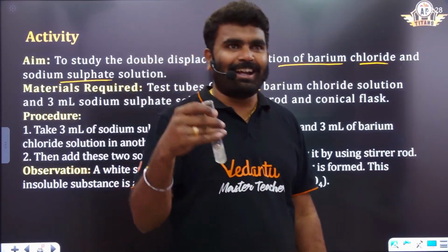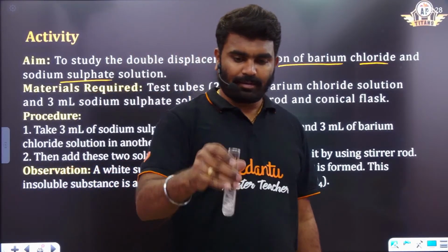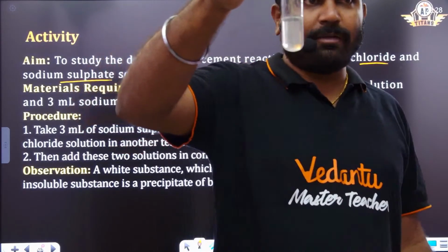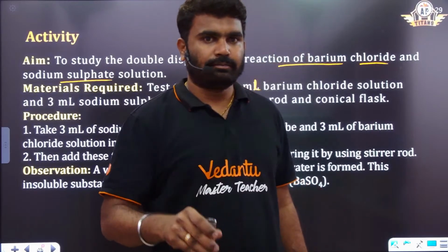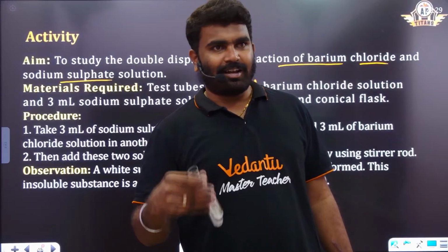Yeah, we are at the end and you join now. So you can see this sodium sulfate is completely dissolved. Right? You are here to motivate me.